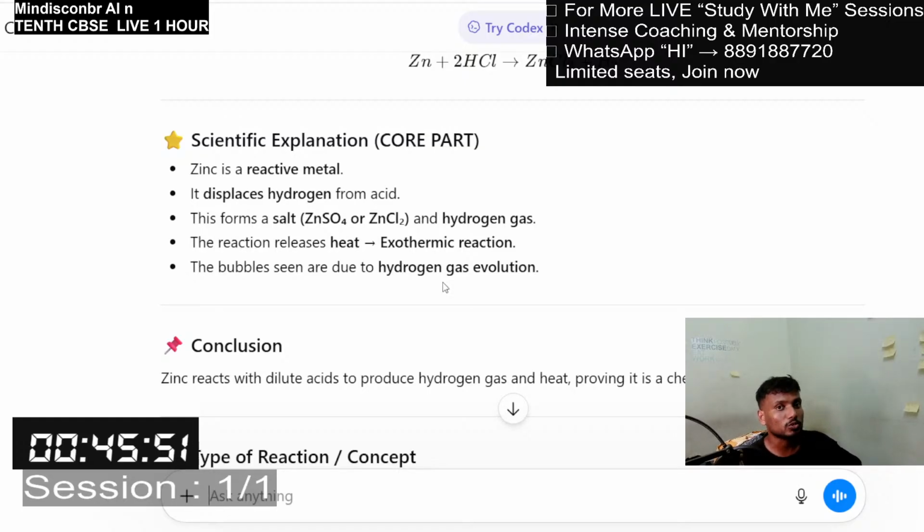In that reaction, it was an example of a double displacement reaction, also a precipitation reaction. We also studied an exothermic reaction in the first experiment, magnesium plus oxygen gives magnesium oxide. There heat was released together with the formation of magnesium oxide.